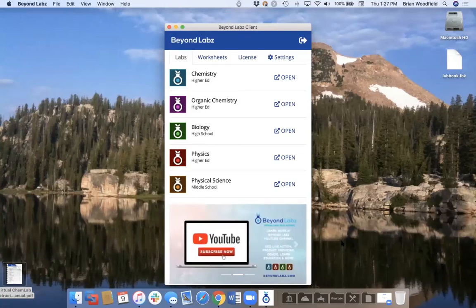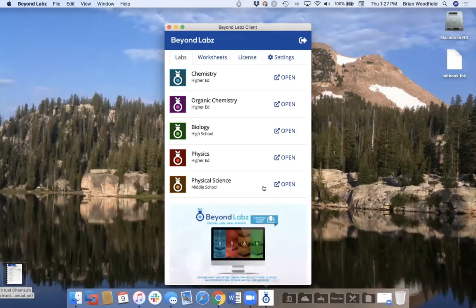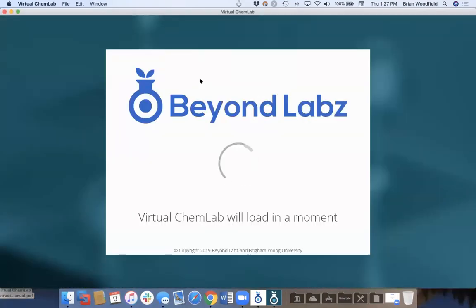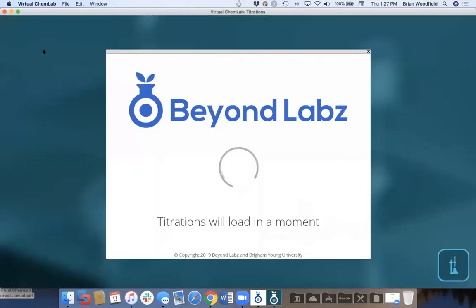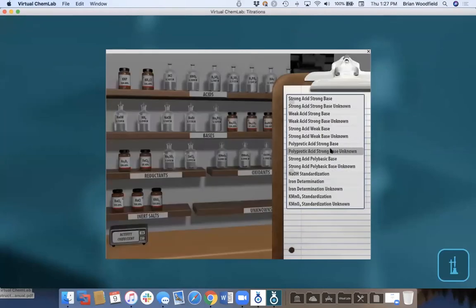All right. Going back to your simulations, you demonstrated, for example, that titration curve with the pH against volume. And it seemed like it was very correctly following the weak acid, strong base behavior. Then that takes me back to the question that I was asking earlier. The Henderson-Hasselbalch equation for that titration curve is very approximate. So are you using other equations to do that, since you caught all the rising portion of the curve very nicely? And are those the kind of simulations we can see?